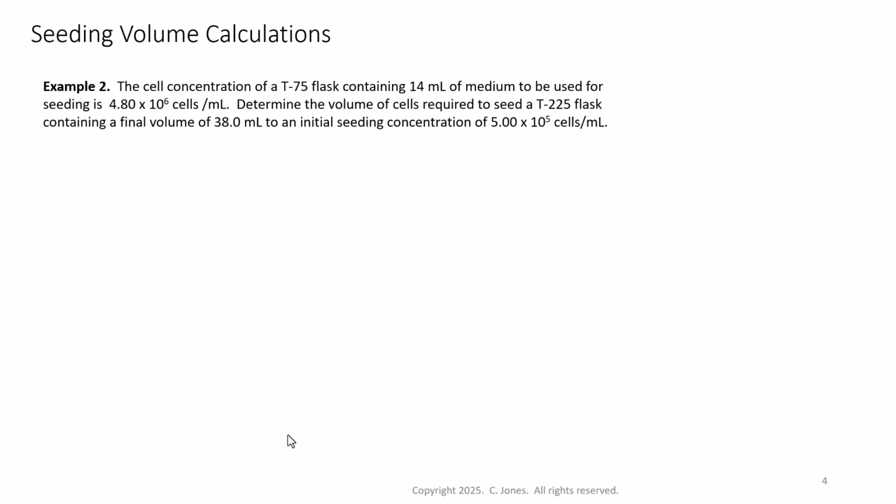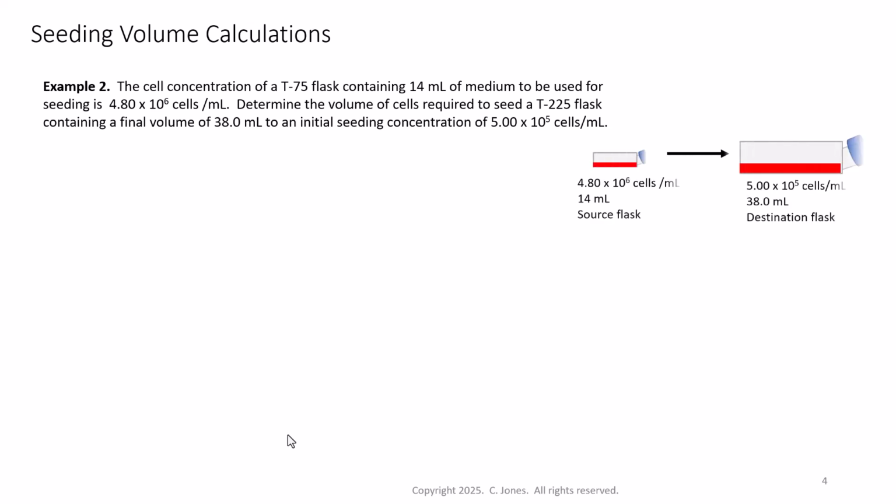All right, I'm back. Let's see how you did. So first, and of course you don't have to do this, but I really do like to make a sketch of the process so I can keep track of what volumes and what concentrations go where, and just have a picture in my head of what's going on here.